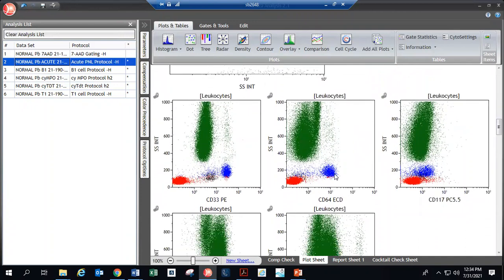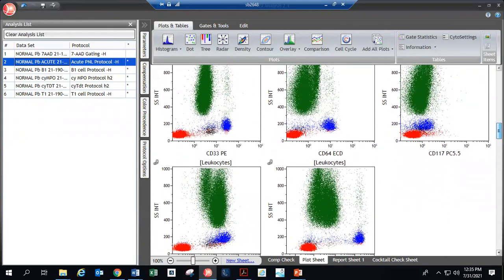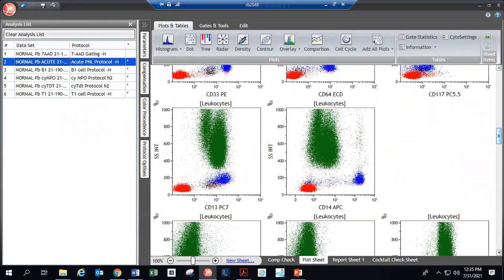The monocytes will have CD64 brighter than the granulocytes. We have been reading that, and it will have CD33 brighter than the granulocytes. We have been reading that. The T cells will not have CD64 and CD33, as we already know. So this is a much more simplified form of what I have shown you. I showed you the father of everything. Once you know that, this will feel like child's play to you.